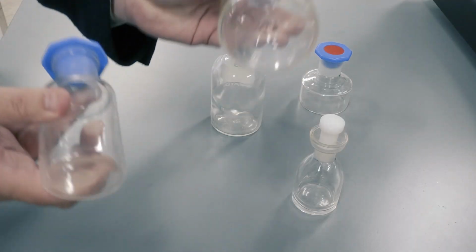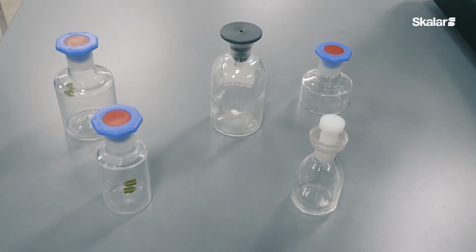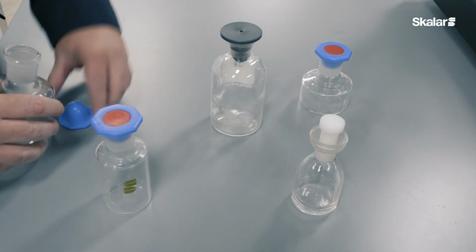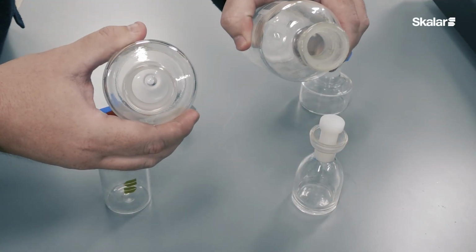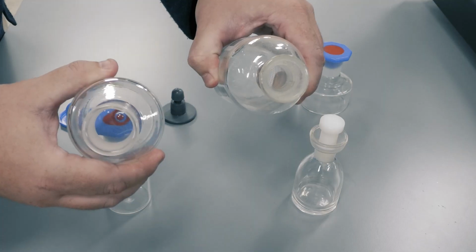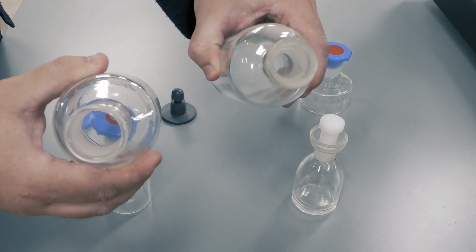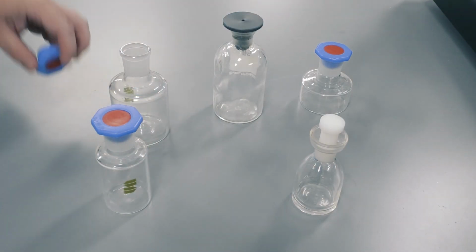Of course, the total volume is the main difference in the end. Factors for us to consider are just, of course, the neck size of the bottle, because you have to keep in mind that we have to be able to go into the bottle with the probe and a stirrer. Of course, some of the probes have the stirrer functionality integrated on them.